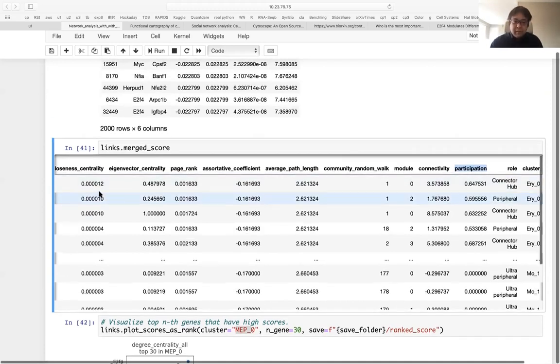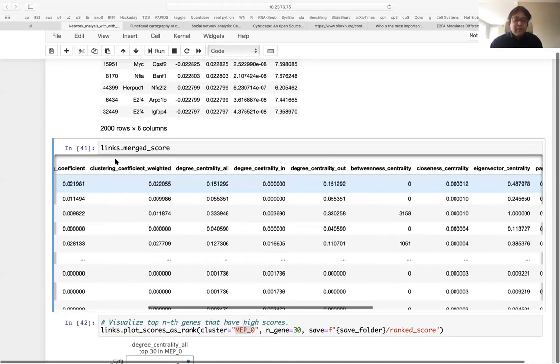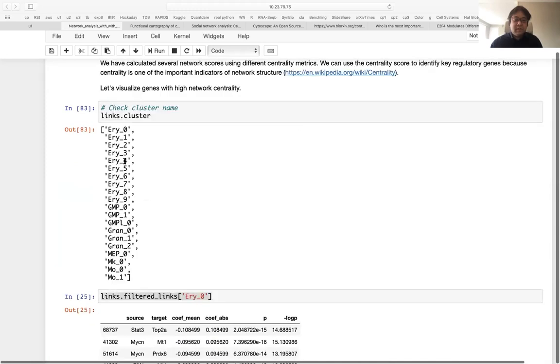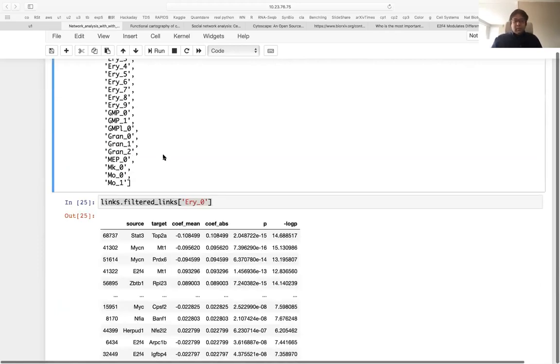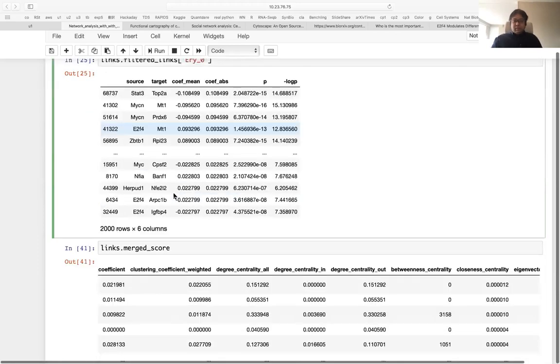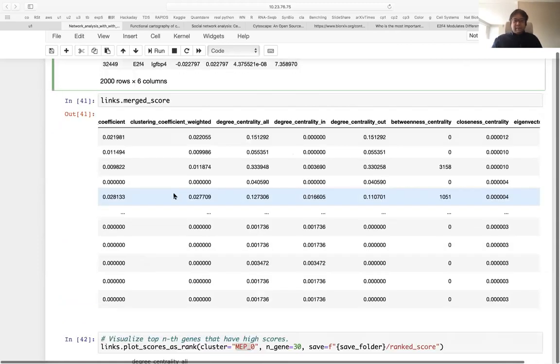We just provide the basic functions for the analysis. And one of the unique points of CellOracle is that we can calculate a GRN for each cluster. So maybe we can compare, or see how it changes over differentiation or something. This is the unique point. Okay. Any questions or suggestions or something?